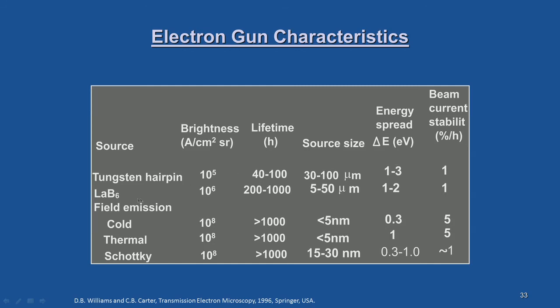You can see that field emission guns have superiority over thermionic emitters in terms of brightness as well as lifetime, and also in probe size. This is very important.